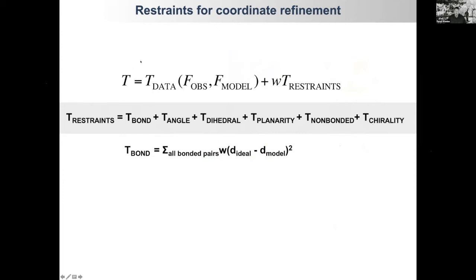Right, remember we had a score function that relates structure factors obtained in this experiment and calculated from the model, and we have some extra information that comes into it. So this extra information goes as an extra term here with some particular weight, and it's just a sum of different contributions, accounting for covalent bond lengths, angles, planes, secondary structure, Ramachandran plot, and so on. Right. So that's how it's done technically.